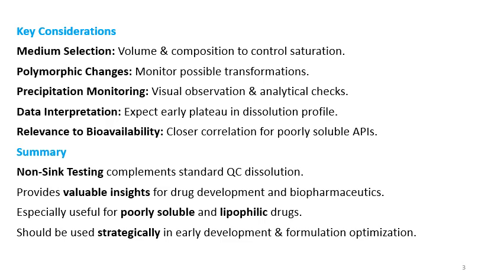If your dissolution does not reach the complete extent, more than 80% or 90%, that means some precipitation or solubility issues are there. A closer correlation for the poorly soluble APIs can be made through dissolution testing in non-sink conditions, and you can relate it to the bioavailability. Non-sink testing complements standard QC dissolution and provides valuable insights for drug development and biopharmaceutics, especially for poorly soluble and lipophilic drugs, and it should be used strategically in early development and formulation optimization.